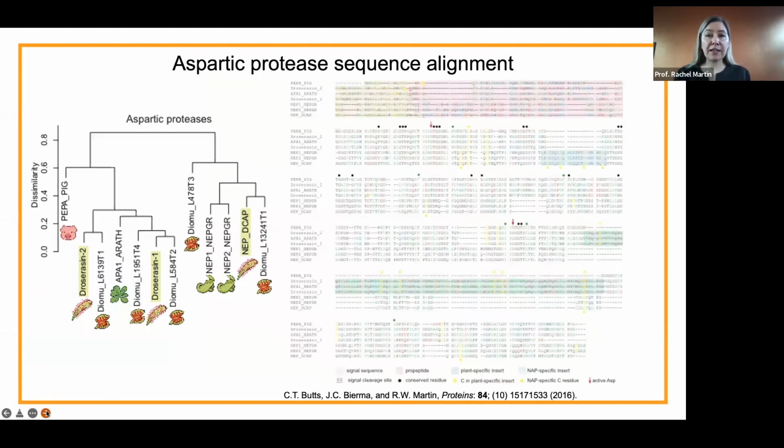All right, so that's just one protein, and you could run with that. Honestly, you could take the whole thing and start expressing that protein and use it for NMR. But there are some other things that we can do too. So one way to choose your target is just to say, okay, which one is most highly upregulated in the plant? And that's a fine way to do it. But it's also useful to look around at what are some other related things in there? Because as chemists and biophysicists, we're not necessarily always interested in the thing that's the most abundant in the organism.